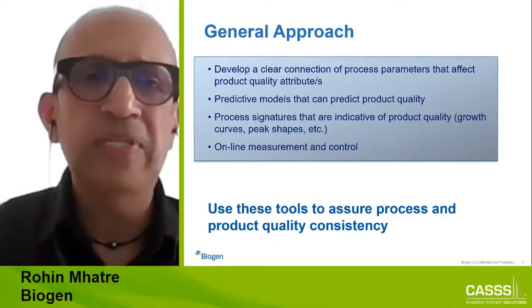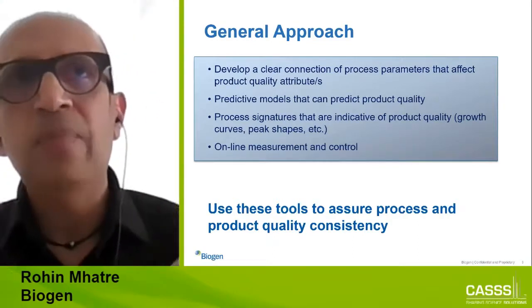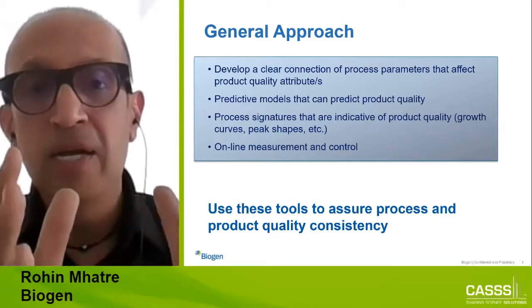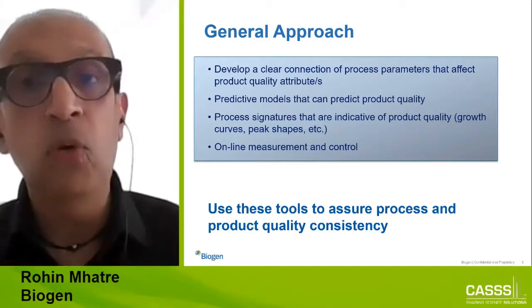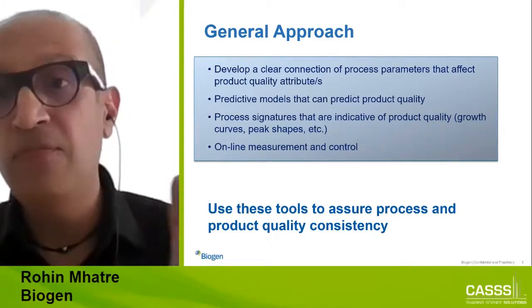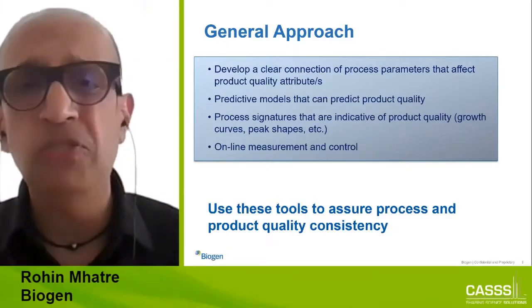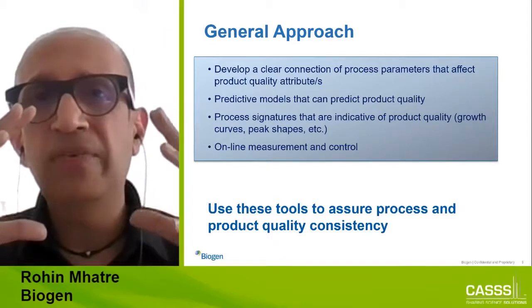It's not so much about that. It's purely getting a sense of what's happening to the process, so we're not looking at it at the end. We're analyzing it from where certain unit operations impact the product quality, and for us to know what's going on. And as I said, starting from the reactor, looking at it over the time frame in a reactor, not at the beginning and the end necessarily, but really doing a time course, figuring out things like how is glycation changing and so on. So that's really what this eventually comes down to.